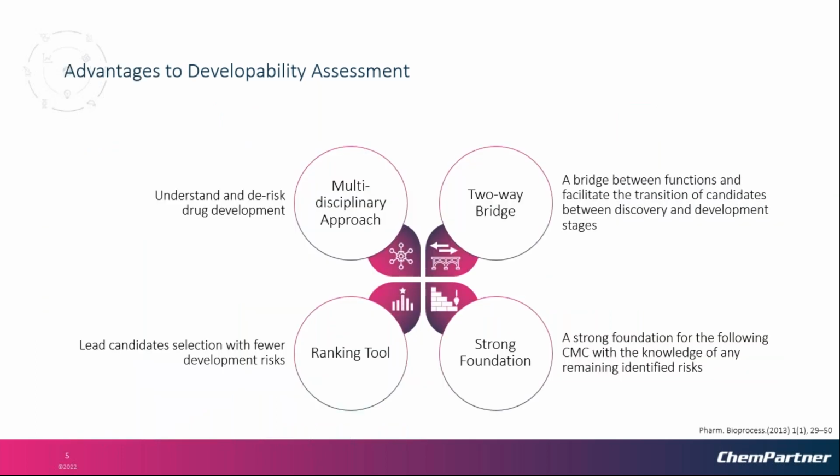So, what is developability assessment? Firstly, it is a multidisciplinary approach. We will use a variety of investigation methods to characterize our candidates. Besides, it's a ranking tool. When we have several candidates, we can compare the data and identify the leading candidate with less risk at an early stage. On the other hand, it is also a two-way communication bridge because it can connect discovery and CMC development functions more closely, which enables a smooth transition from discovery to development of the leading candidate. Finally, it is also a solid foundation for CMC development. With a systematic evaluation of the candidate and knowledge of any remaining identified risks, the failure of CMC development will be greatly reduced.